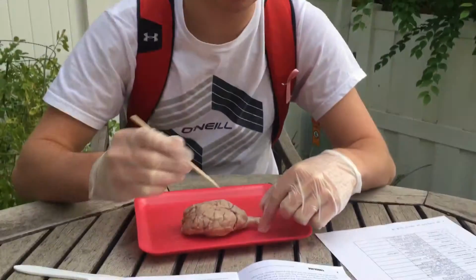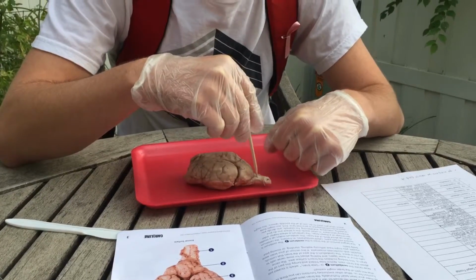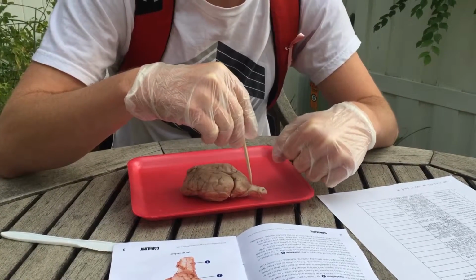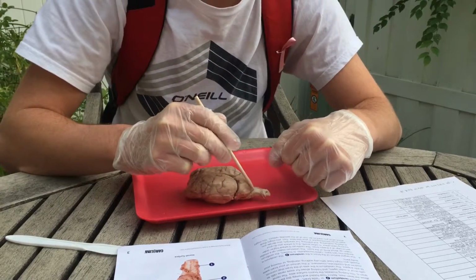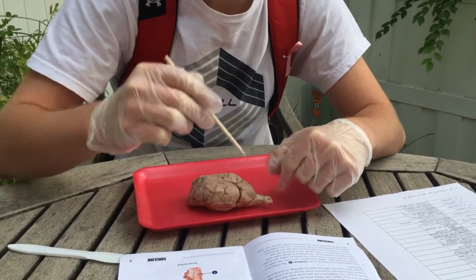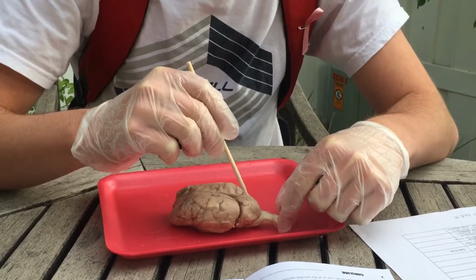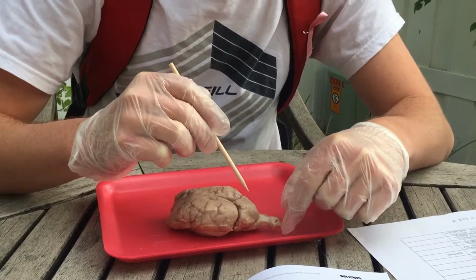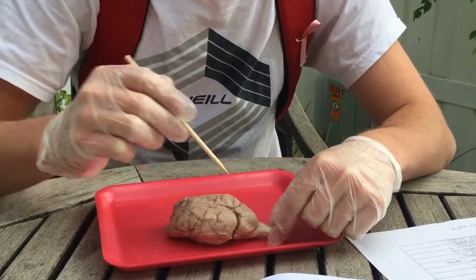Alright, so this is our sheep brain. Right here, as you can see, we have the brain stem. And the brain stem controls the flow of messages between the brain and the rest of the body, and also controls some basic bodily functions. And then, as we go on, we have the cerebellum, which is right here. The cerebellum coordinates voluntary movement and balance with the body.